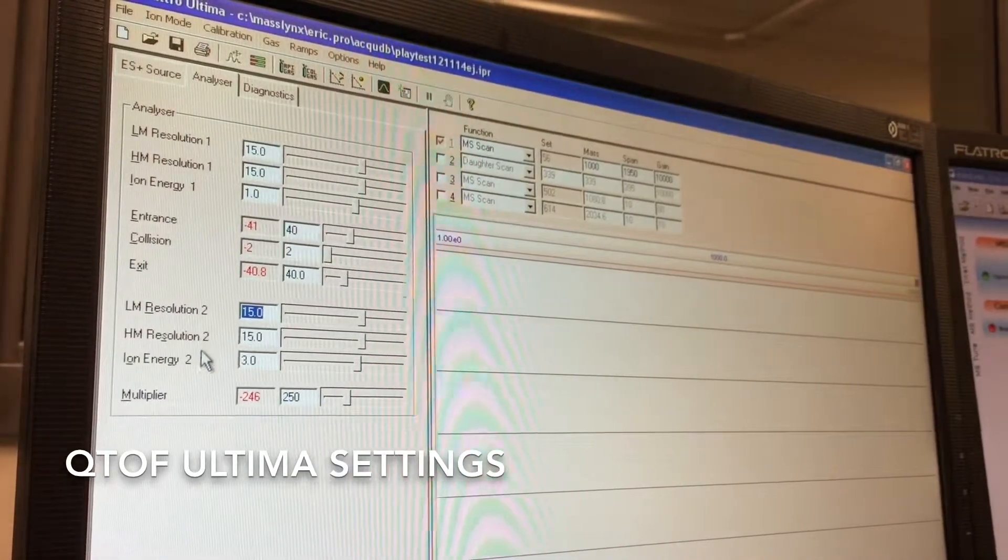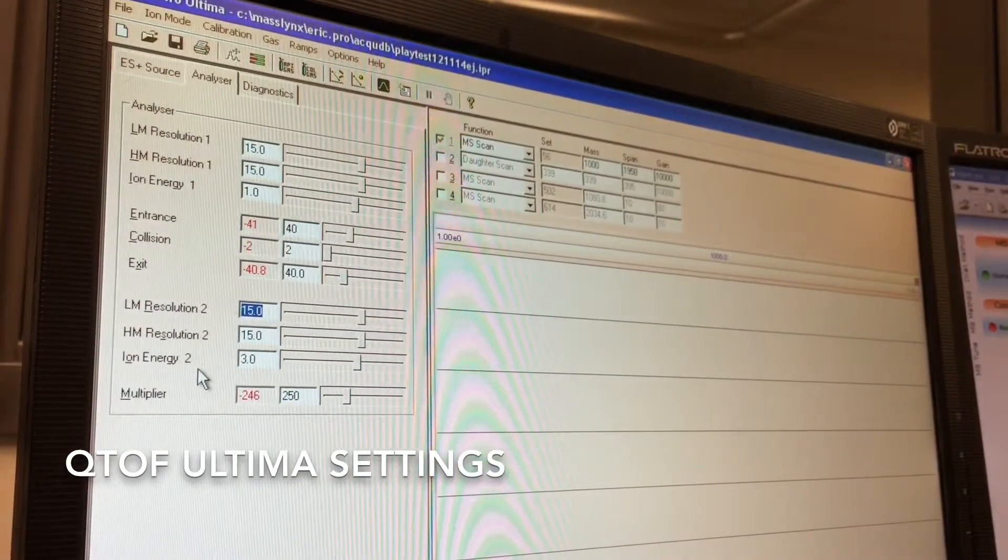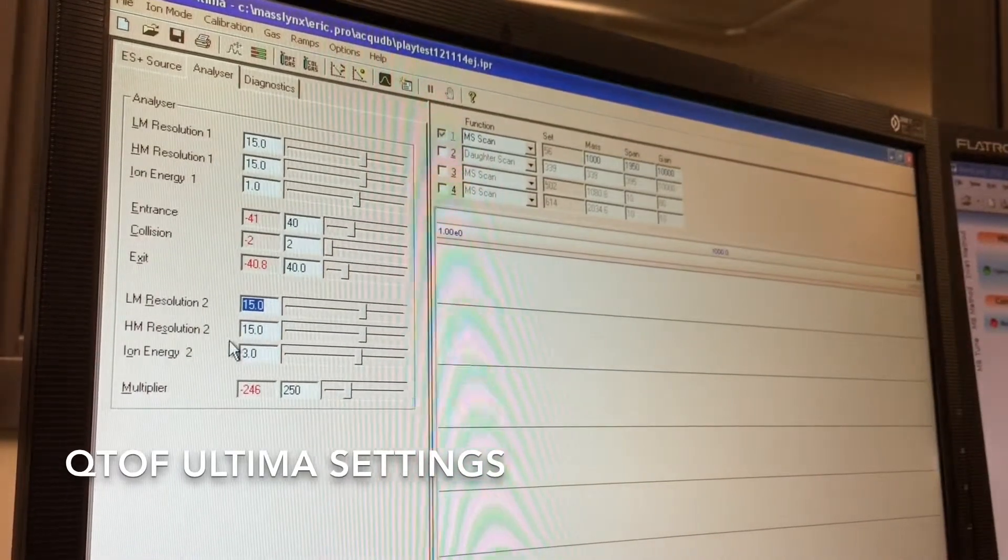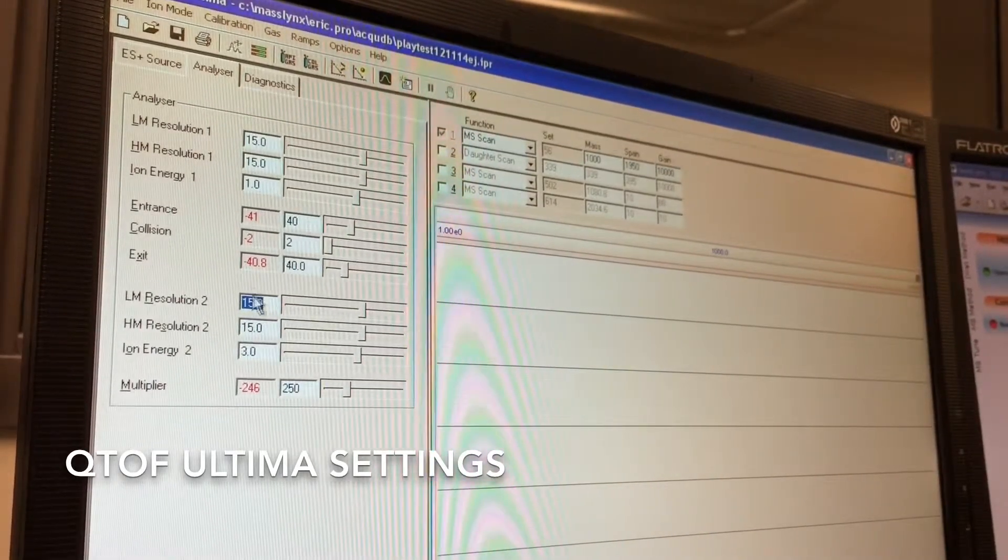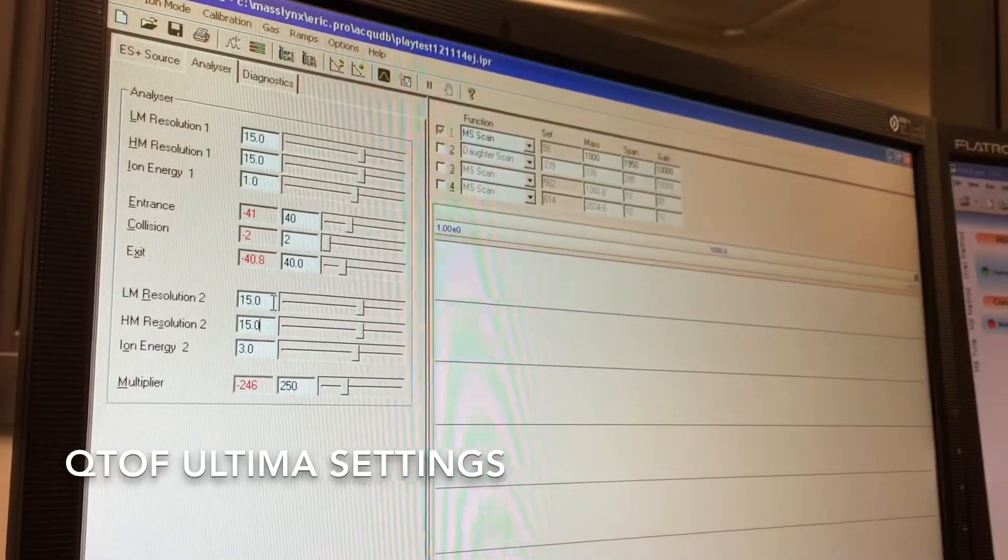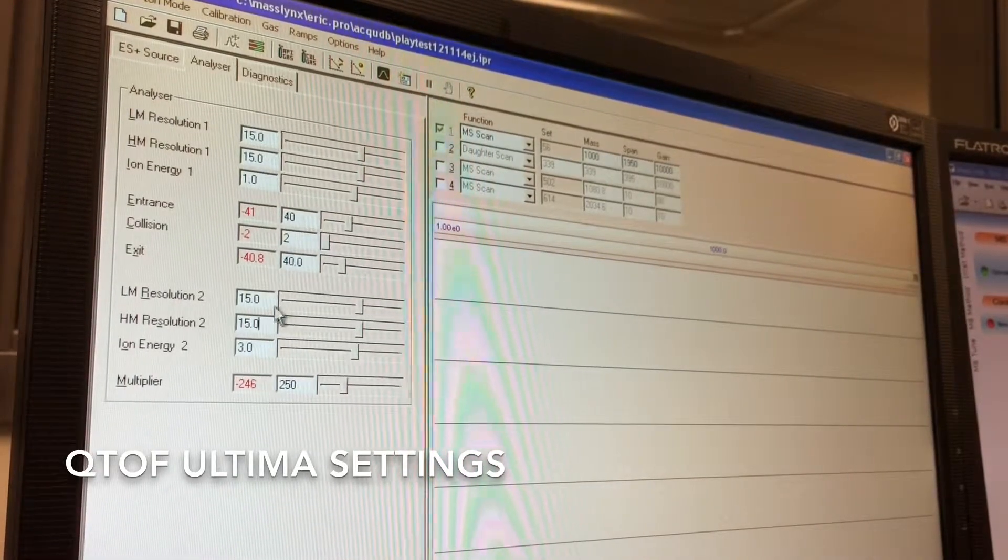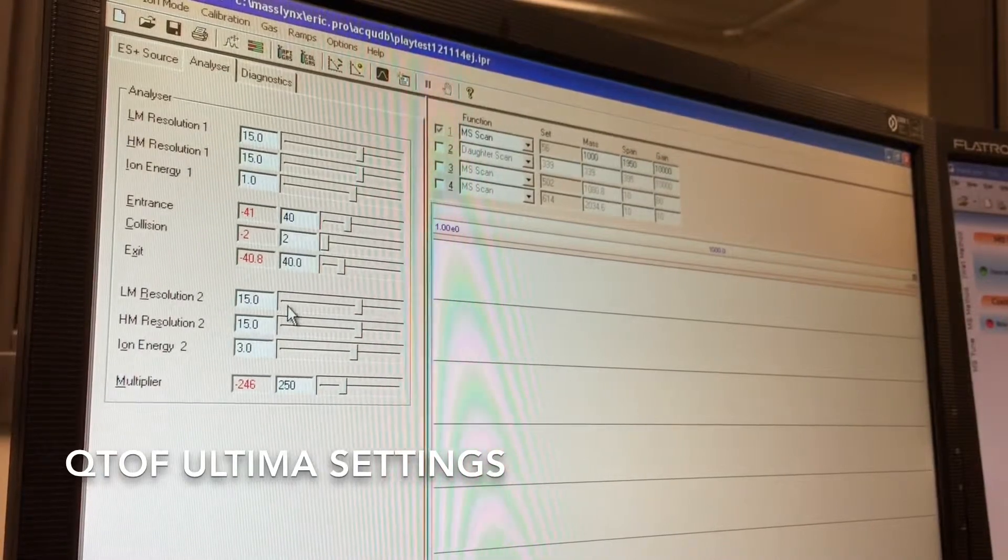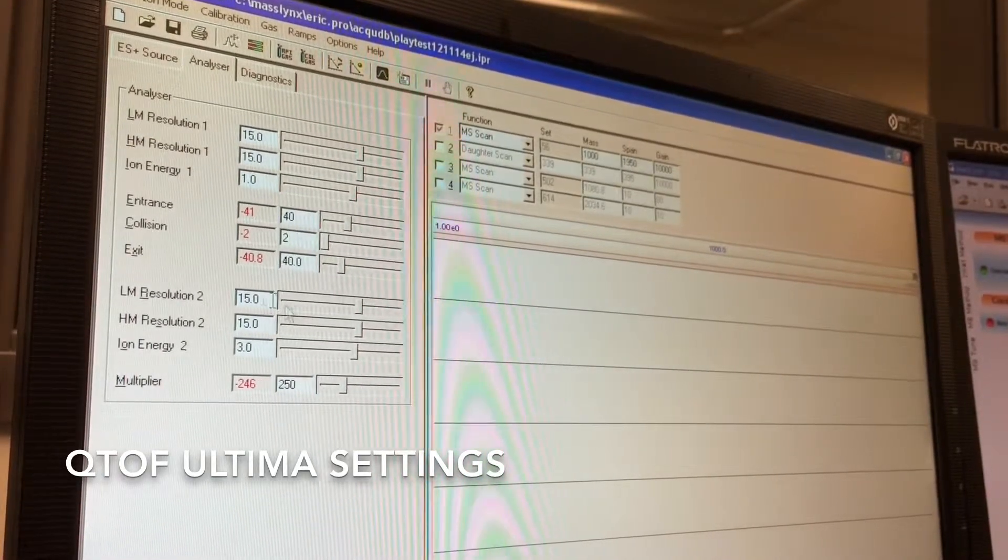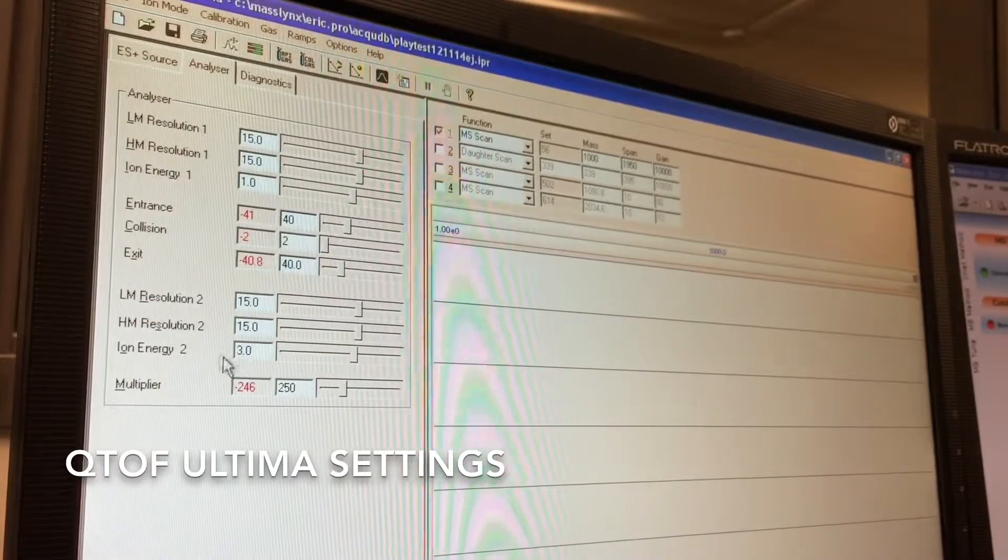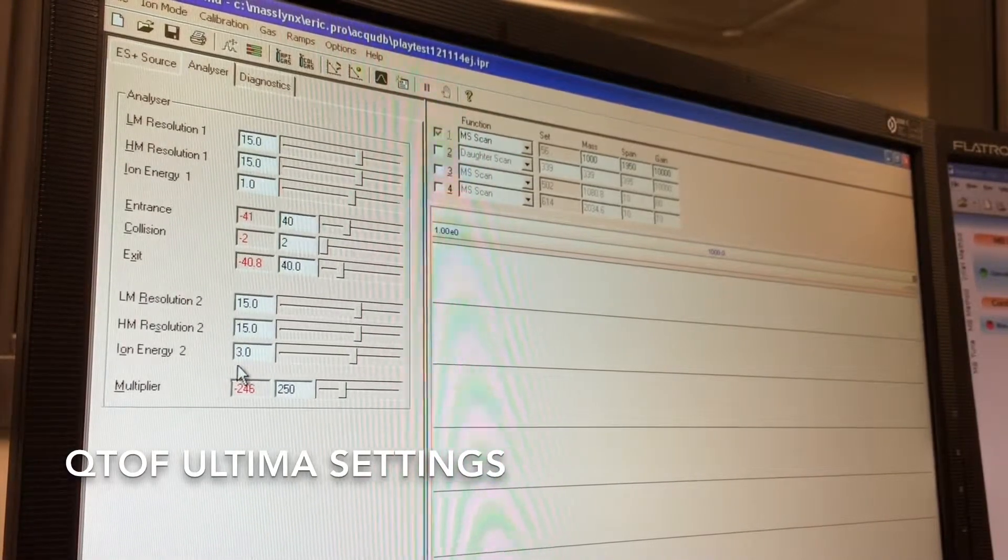The LM, HM and ion energy 2 are for the third quadrupole in the system. This will dictate what kind of MS-MS resolution you have. If you want to let your fragments just pass through unhindered, you can drop this down. But if you want higher resolution on your fragment ions, you will want to increase this. And generally I have ion energy here set to 3.